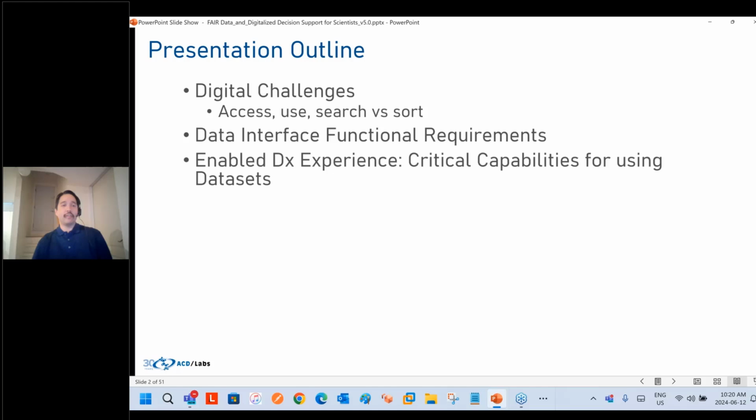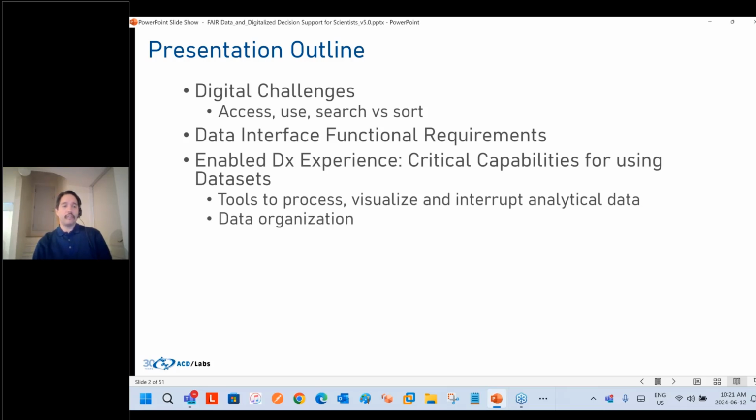At that point, just giving some examples of really digital transformation experience. And crucially, how to process, visualize, really do identity composition, data organization. A crucial thing, you're not looking at one type of analytical technique. You'll have several differing techniques, and being able to have that information together, store it, and view it, and have that intelligent layout.